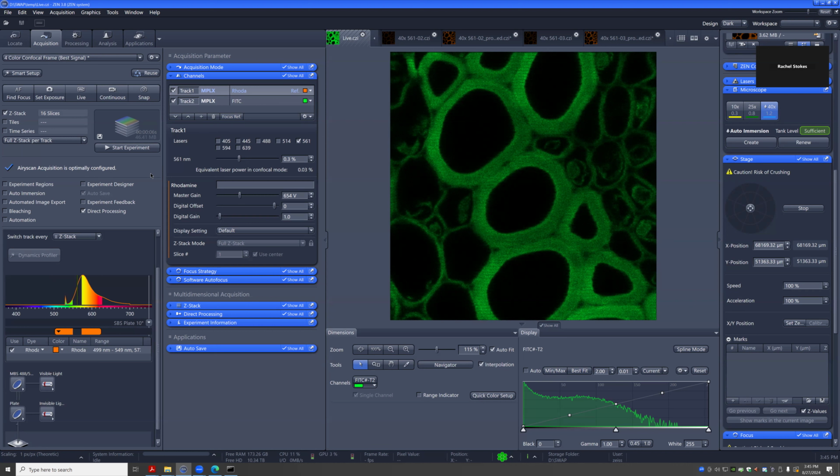Even an hour or so, I would probably leave it on. Once it goes hours, you can turn it off. If the system is warmed up and someone turns it off, it starts cooling down and then warming up again, and especially right at the start of imaging you'll get some drift. So just leave it on in that case.